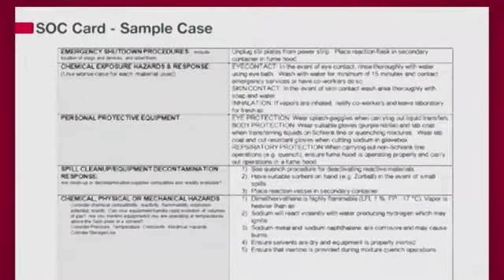Step 3. List appropriate emergency response information. If there is an incident, this is the section to find specific directions. Be sure to include appropriate procedures to perform in an emergency, including shutdown, chemical exposure, and spills. And don't forget to list appropriate personal protective equipment and any unique chemical or physical hazards that may be present.